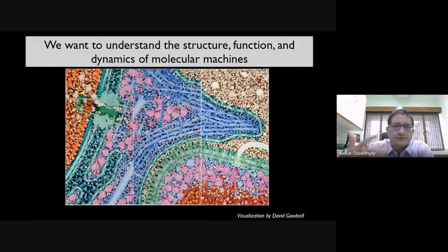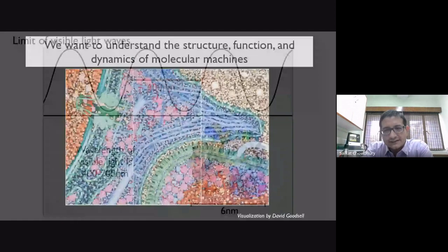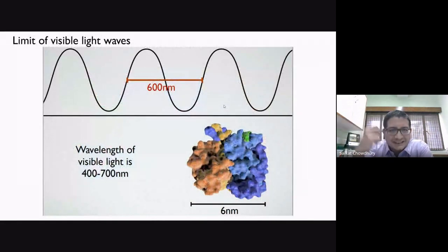But these all come from different cell biology techniques, as well as many structural biology techniques, primarily microscopy and crystallography, that have given us all this structural information. But in the context of a cell, you see how crowded the cell is and how these different things are organized, right? So these are the things that we gain from all these structural techniques and methodologies. Now, why do we need such fancy things? If you think about just a light microscope, we can't see things which are really tiny, at the level of some nanometers to angstroms.